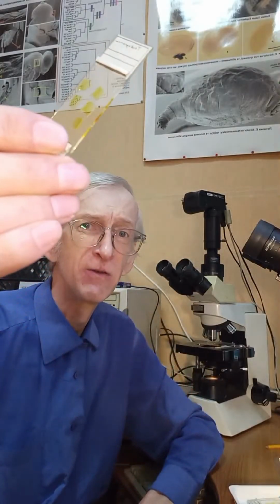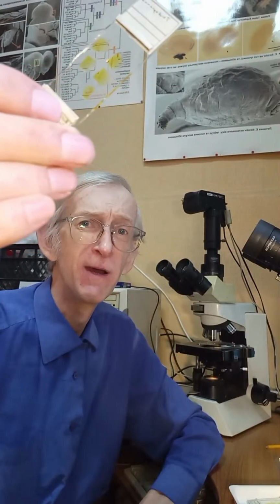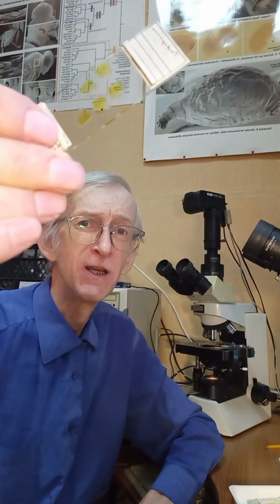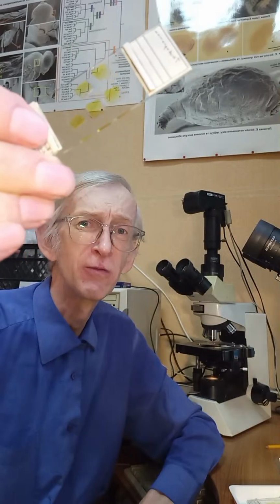I invite you to participate in this online direct stream from the laboratory, because I will be watching my microscopic slides with very tiny insects. These are Trichogramma egg parasitoids, just 0.5 millimeter size, half of a millimeter. That's why I need to make special microscopic slides to put this tiny insect on glass. You see, I put cover slips over my tiny insects. This is a glass slide with a cover slip, and my insects inside a special liquid for investigation under the microscope.